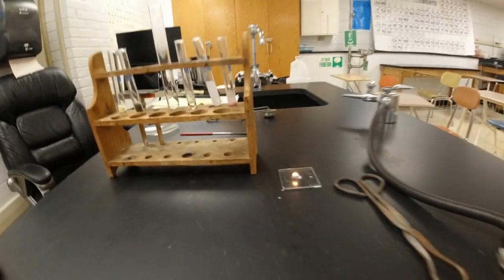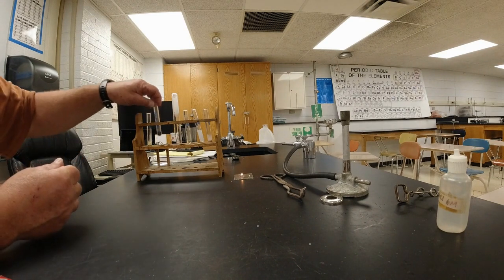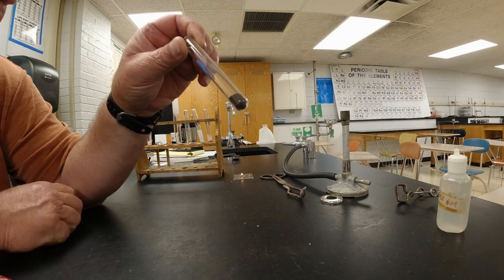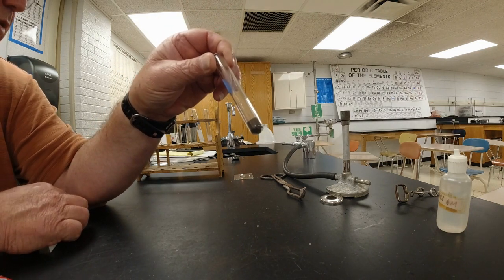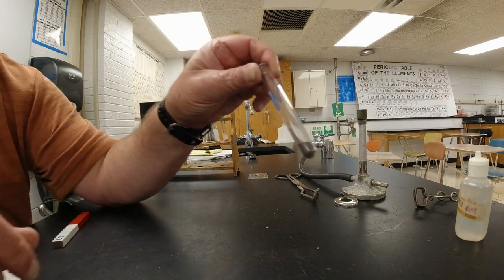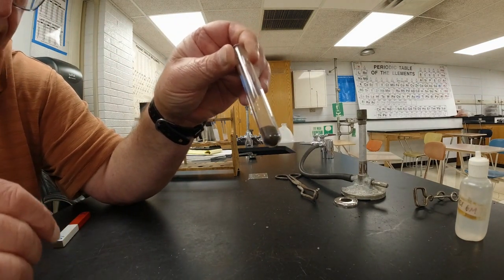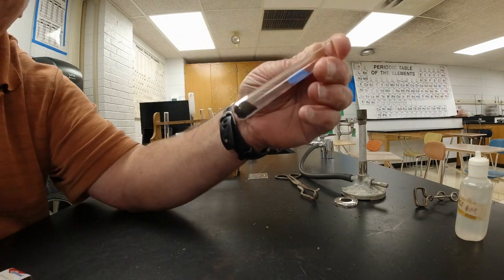All right, while that's still burning a little bit here, let's look at the other thing. I have got some iron. The chemical symbol for iron is Fe. And this is ground up, and it's called iron filings when it's like that. If you look at the candle, almost gone, almost gone. So we have iron, and they're called filings. The candle just went out. Iron filings, like this. Now, iron is one of the few metals that is actually magnetic.